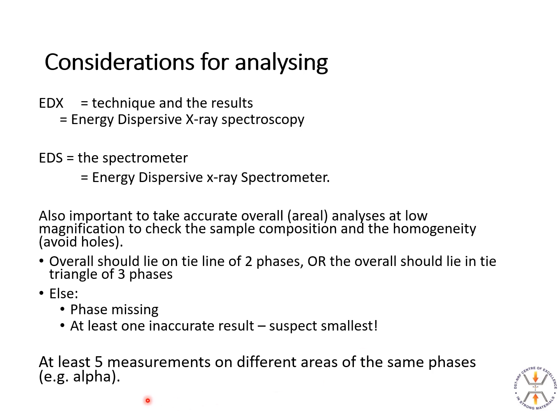Okay, it's a good idea to do 5 measurements on different areas of the same phases. Then you can work out an average and present it with a standard deviation, and then you can see how good your results are.